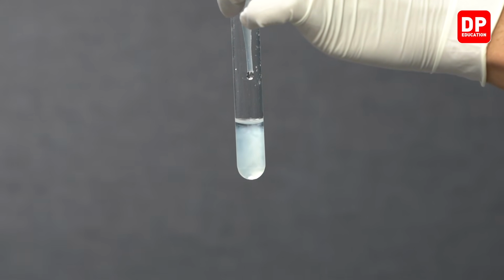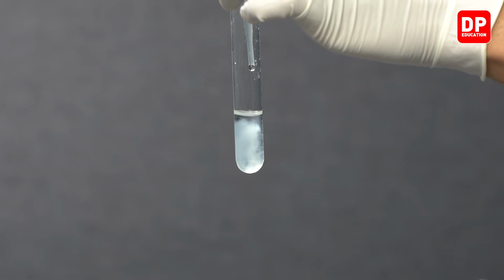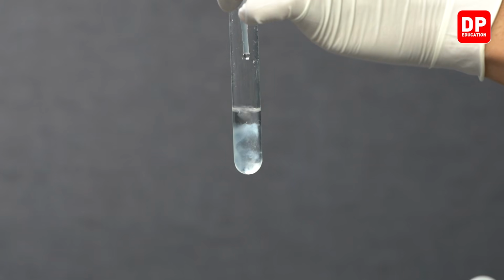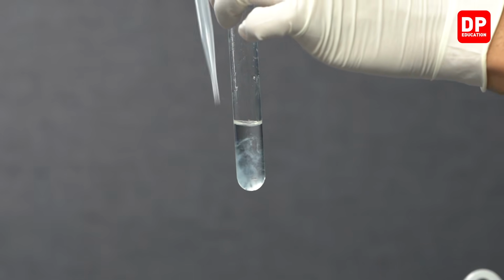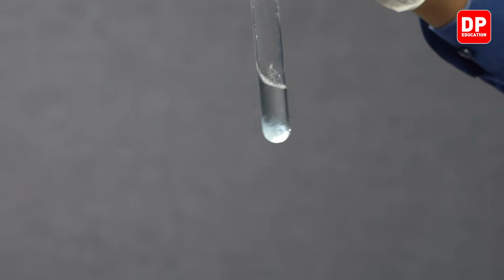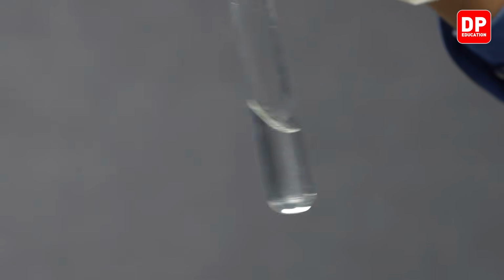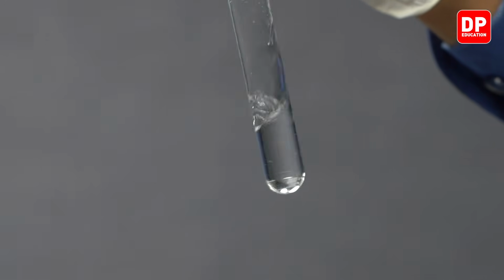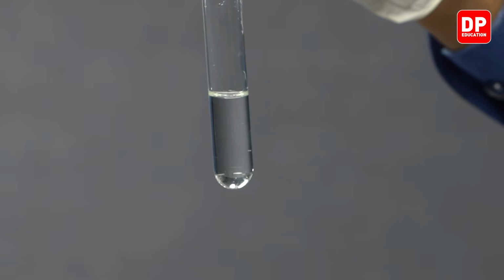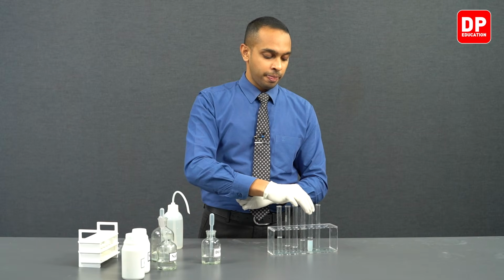You can see as HCl is added, the white color magnesium hydroxide precipitate is starting to dissolve. Now if I mix this suspension really well, it will come into contact with the HCl really well and dissolve all of the magnesium hydroxide that we had in this test tube.